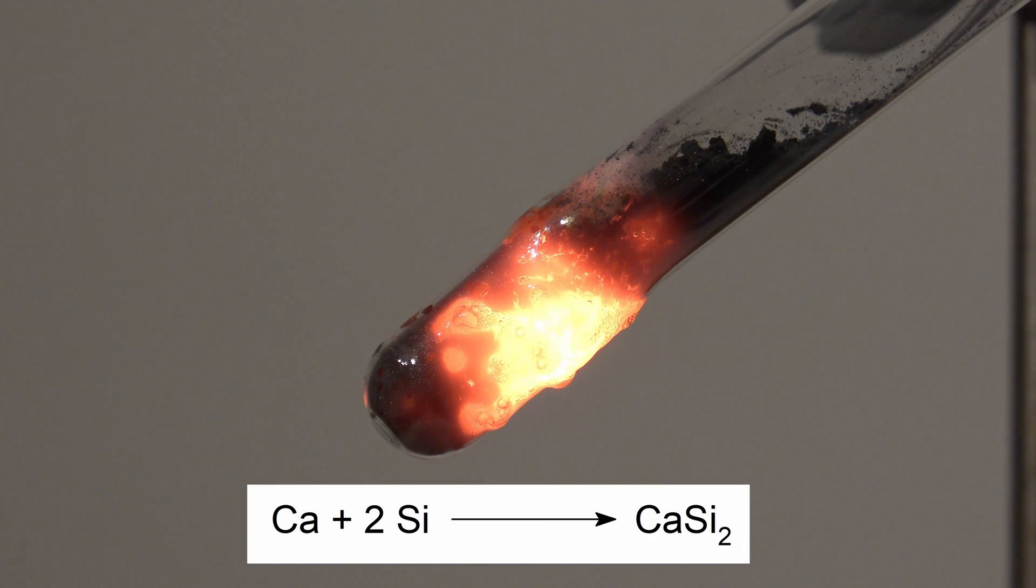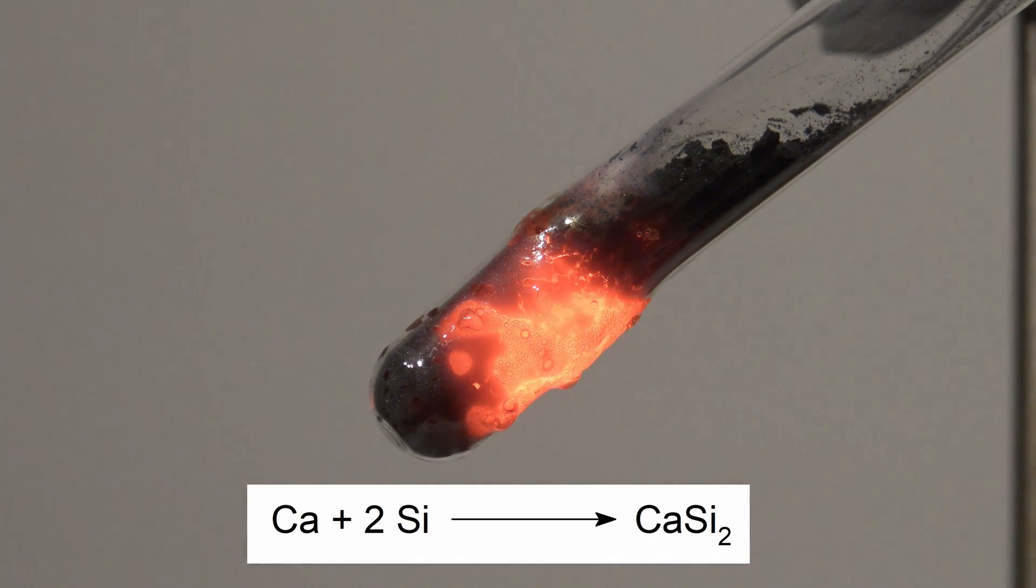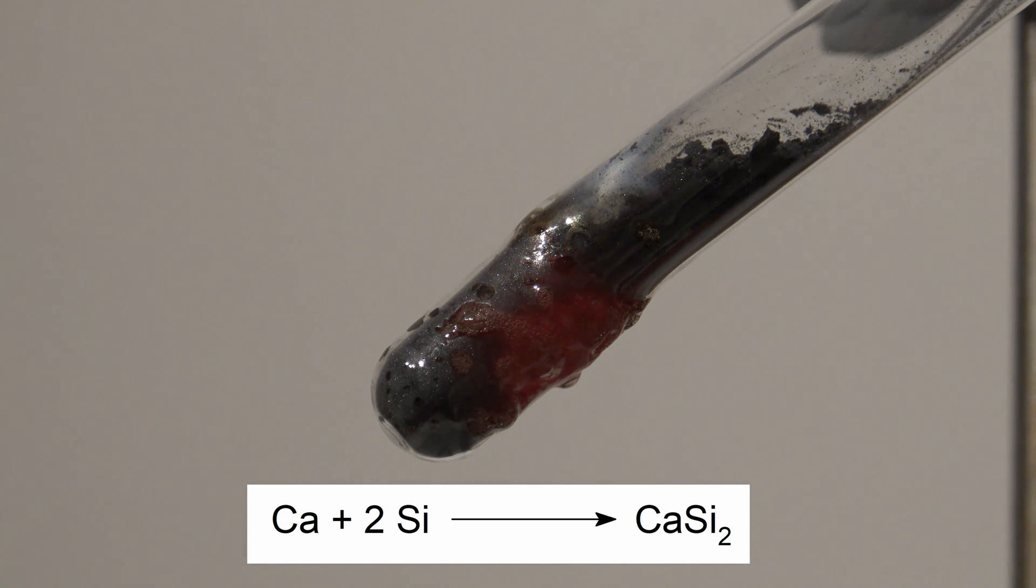The calcium reacts with the silicon to form calcium disilicide. It also reacts with the glass, leading to a less pure product. Nevertheless, this is not a problem for the following experiment, as quite a lot of side products are formed anyway.